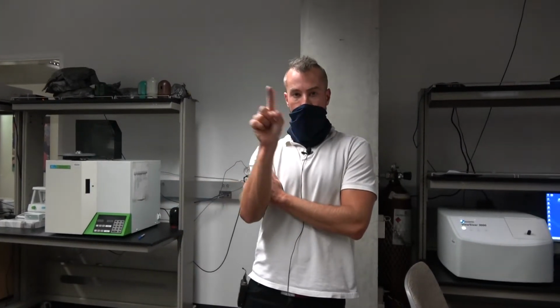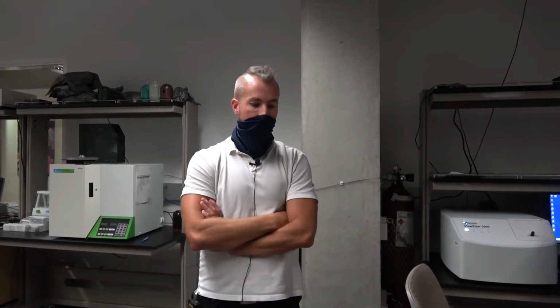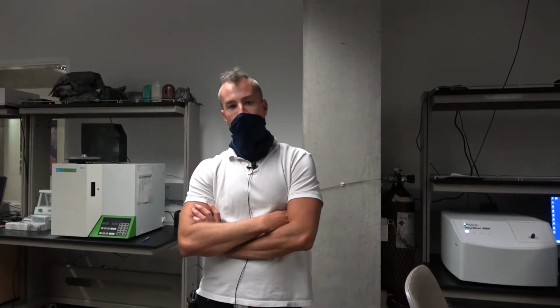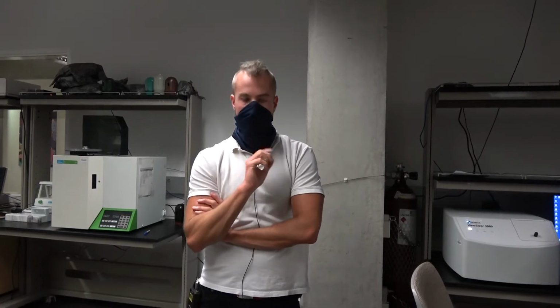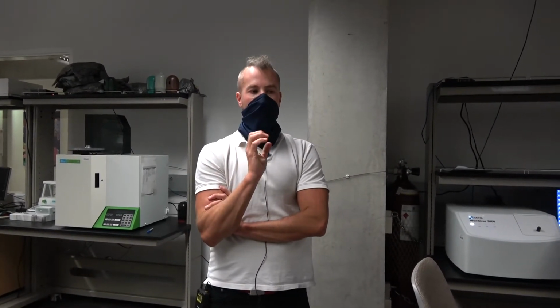But once you have the dilution factors correct, the instrument is analyzed, what you're going to see are these particles moving in real time due to Brownian motion. And similar to what you learned in dynamic light scattering, that Brownian motion is dependent upon the size of the particles. So therefore, we can back calculate with pretty high accuracy the size of the particles. So that in and of itself is great.